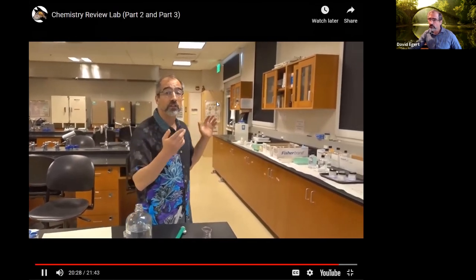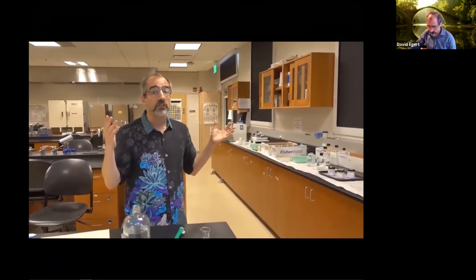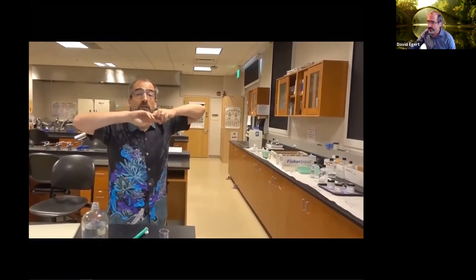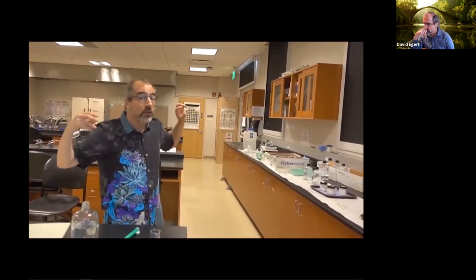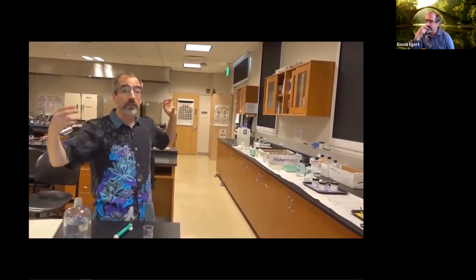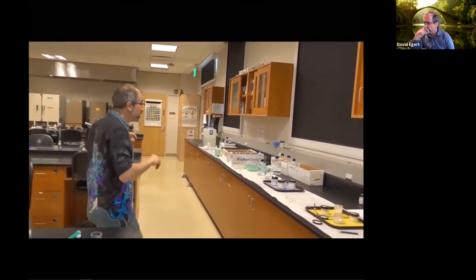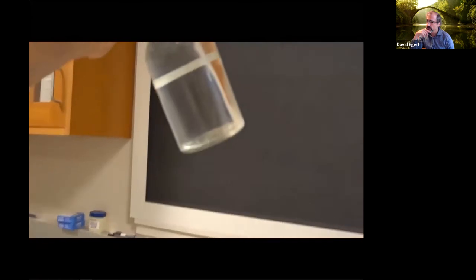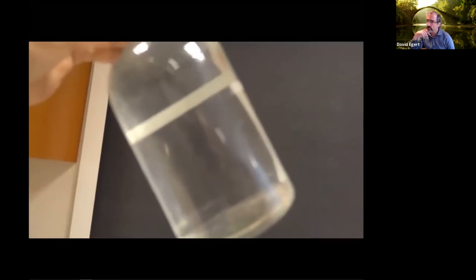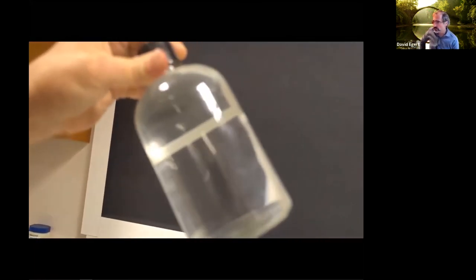The last part of the carbohydrate part is just looking at the optical difference of what sugar water glucose solution looks like compared to starch solution. Starch is just a whole bunch of glucoses bonded together in big long chains, and it will go into solution, but becomes a colloid. And it's worth taking a look here. This is the sugar water, a true solution, which by definition is not going to scatter light, is going to basically be transparent.